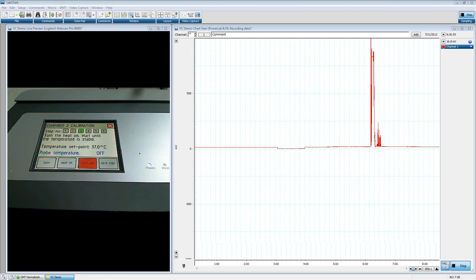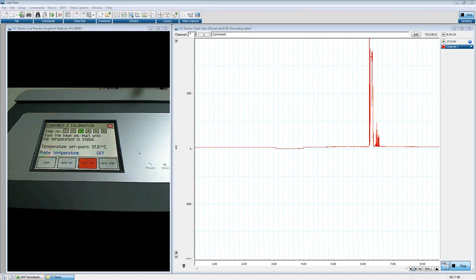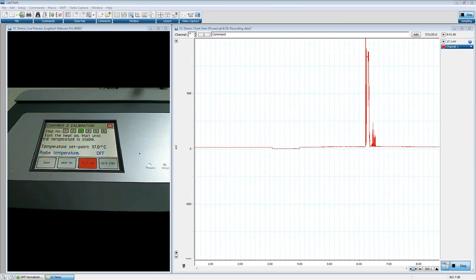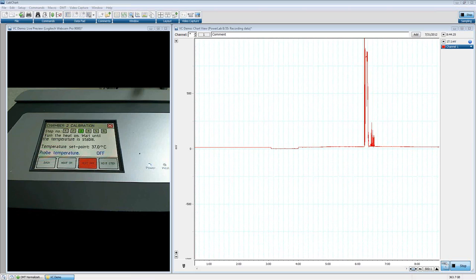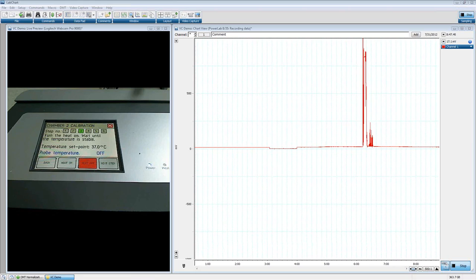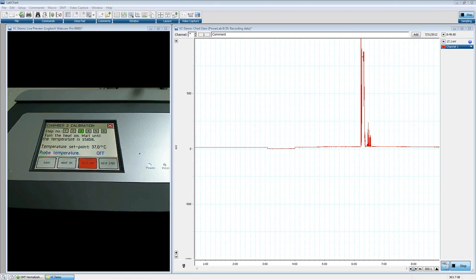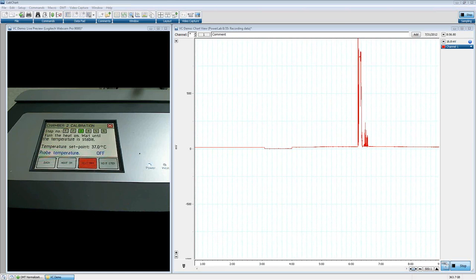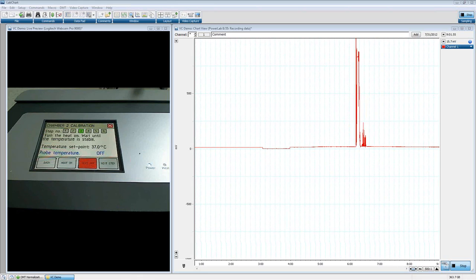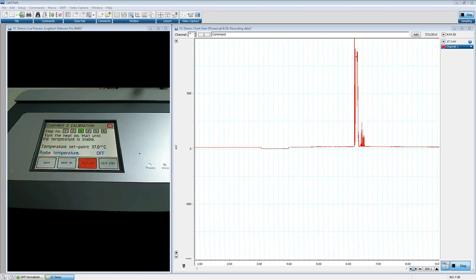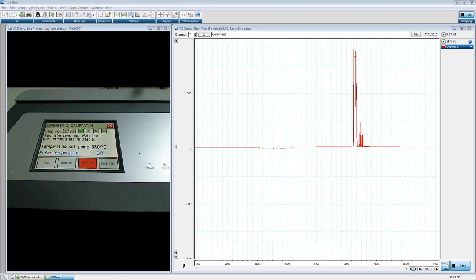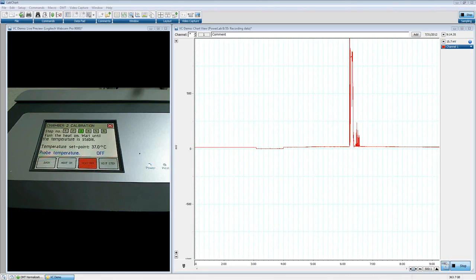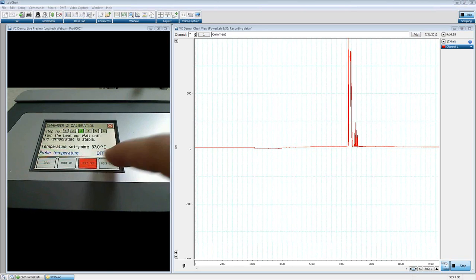Next, make sure the heat is on. Temperature is an important part of calibration — I don't want to minimize this. You need to wait for the temperature to equalize to 37 degrees Celsius, or whatever temperature you'll be making measurements at, before beginning the calibration procedure. This is a key aspect because these force transducers, like many transducers, are affected by temperature.